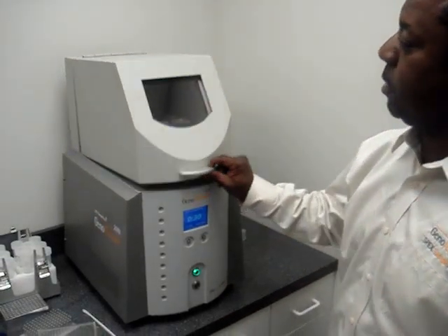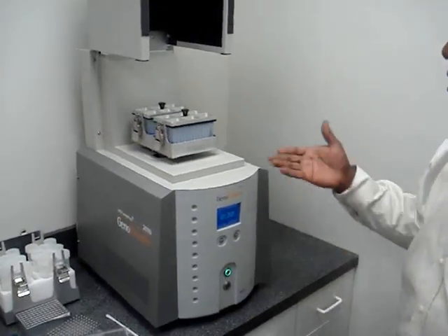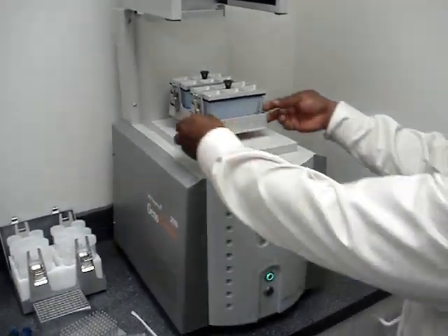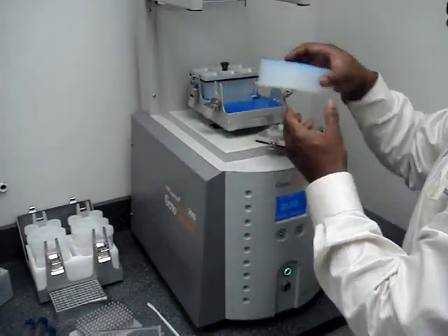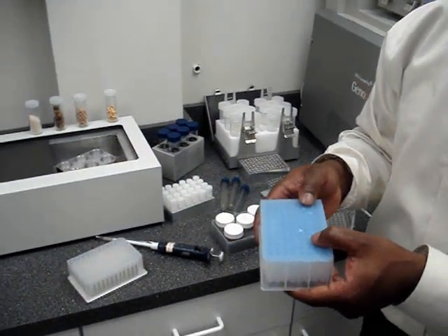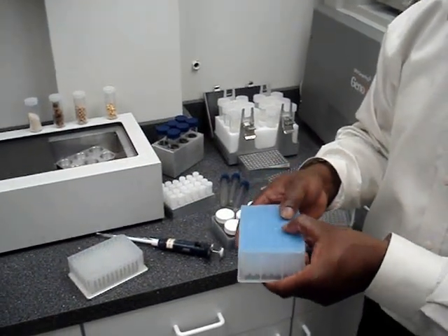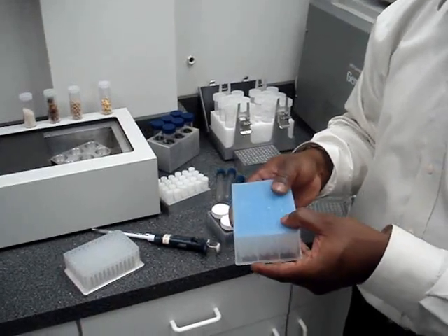By pushing the green button we'll start the Geno Grinder running. Once the system reaches zero it automatically stops. Then take the sample out of the clamp assembly, put it into a centrifuge and spin the samples down to get your supernatant to the bottom of the titer plate and do your extracting methods.